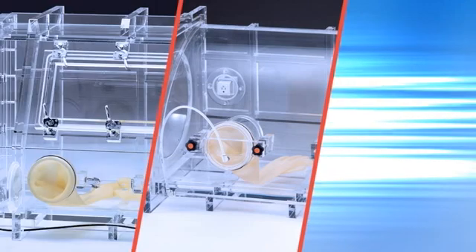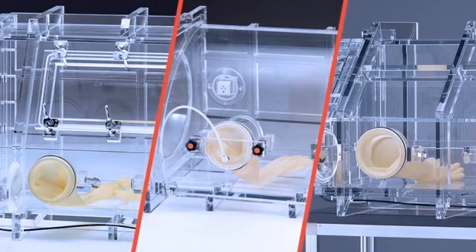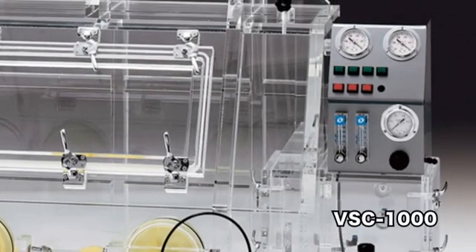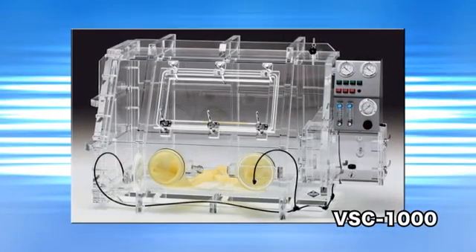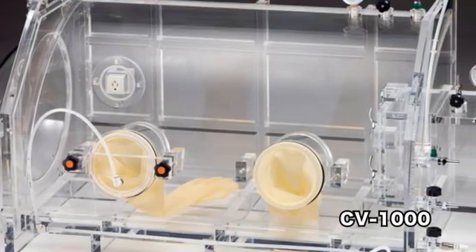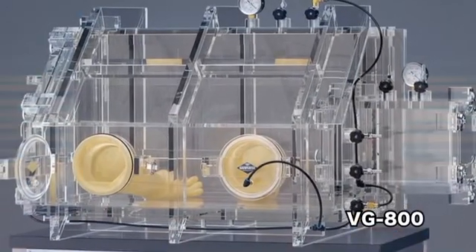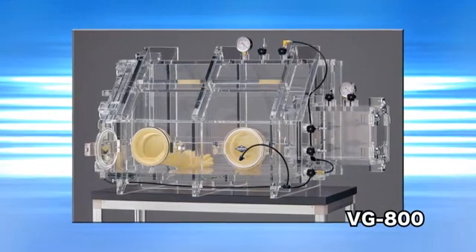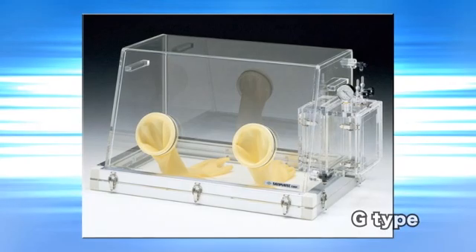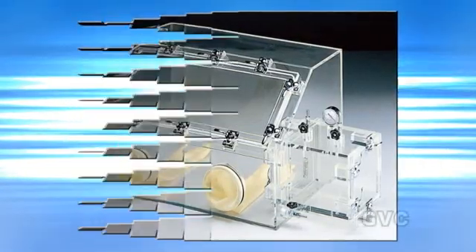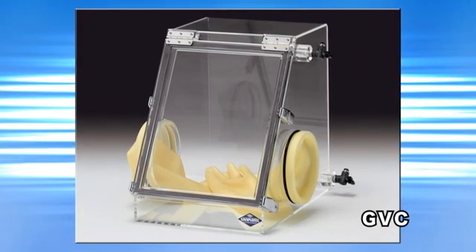Sanplagic has a lot of variations of the vacuum glovebox. The VSC1000 type, which can be operated by buttons. The CV1000 type, which is all clear view. And the VG800, the standard type. We also have the G type for a reasonable price with only the gas purge. The deluxe 2 type, and the GVC compact type.